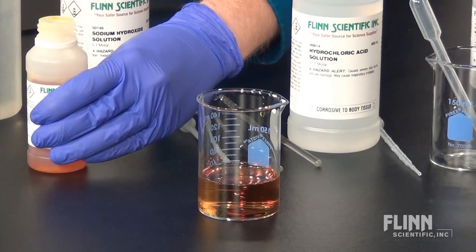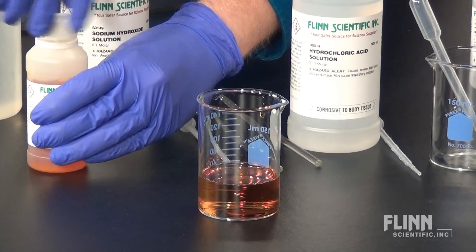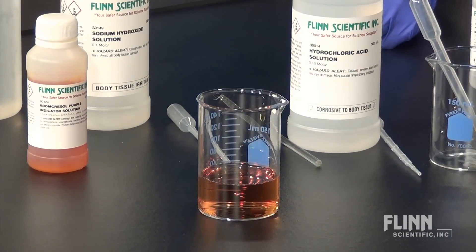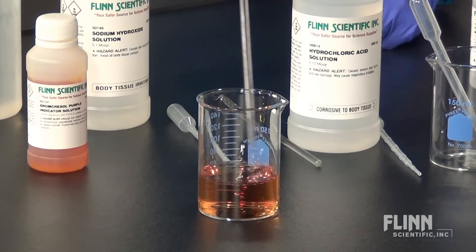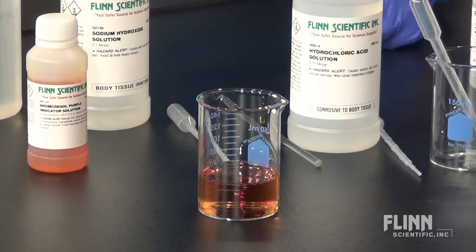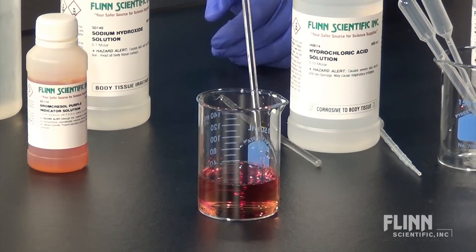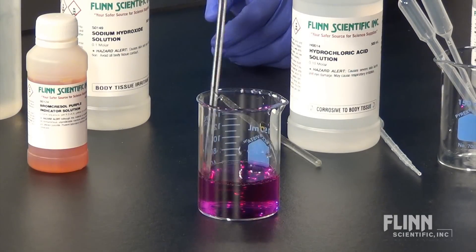To determine if this indicator can be used for your experiment, fill a 150-milliliter beaker with about 50 milliliters of distilled or deionized water, then add a few drops of the indicator solution and stir. Next, add a drop or two of 0.1 molar sodium hydroxide — the solution should turn purple.